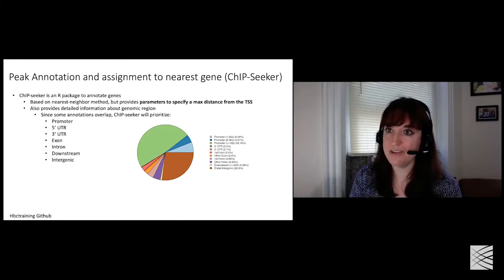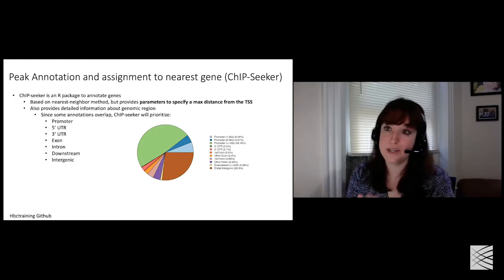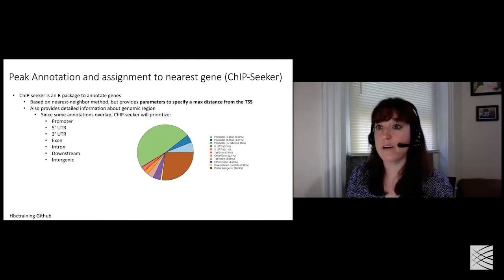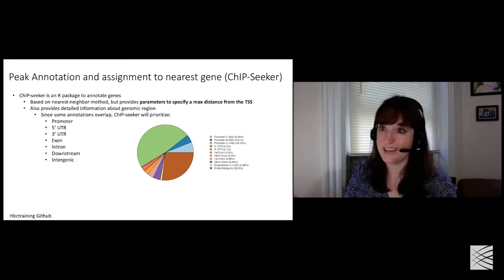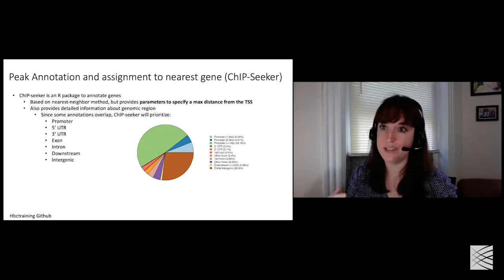It's a relatively new technology, but basically what happens is, just like single cell RNA-seq from our talk last week, single cell ATAC-seq is at much lower resolution. And what happens is you cluster the cells by their nearest neighbor, exactly the way we learned last week for RNA-seq. And then those clusters are combined to call peaks. And so even though each region may only have 1 or 2 reads per cell or per nucleus, when you put them all together, you can then say, okay, there's 2 in every single cell in this cluster, and that is enriched over the regions around it. So it relies heavily on clustering and combining of clusters to call peaks.